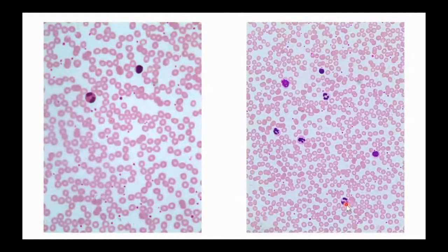So leukocytes, white blood cells, are the immune system cells. Erythrocytes, red blood cells, are the ones that transport oxygen. Most of your blood is made up of these erythrocytes. Remember that we studied for lecture how water can go in and out. They're floating around in plasma, so the open space you see here is where the plasma would be.